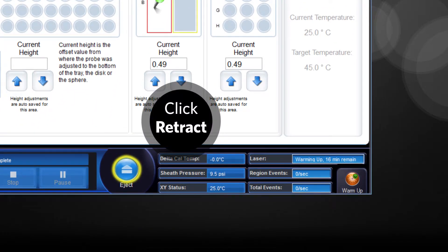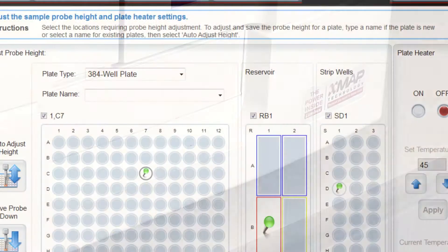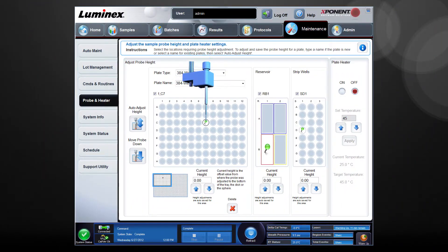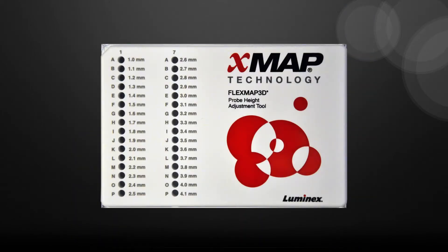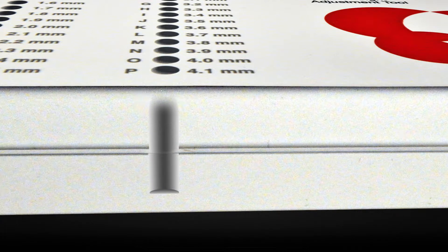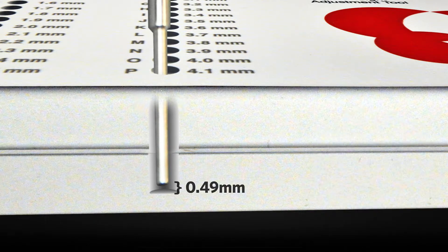Click Retract to retract the plate carrier. Type a name for the plate in the plate name box. Click Auto Adjust Height. The probe automatically adjusts itself to the selected locations and the new settings are saved automatically. Please note, the probe automatically adjusts the distance from the bottom of the well you selected on the probe height adjustment tool. Once the probe reaches the bottom of the plate, it automatically backs off 0.49 millimeters to allow the sample to be aspirated.